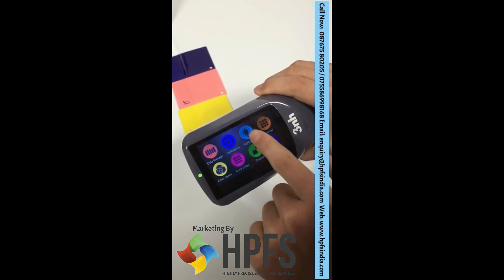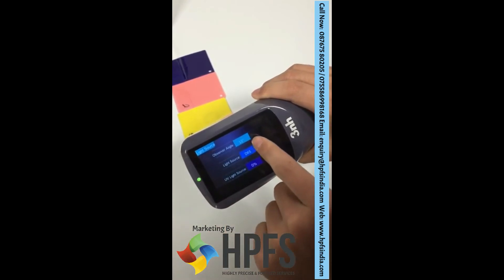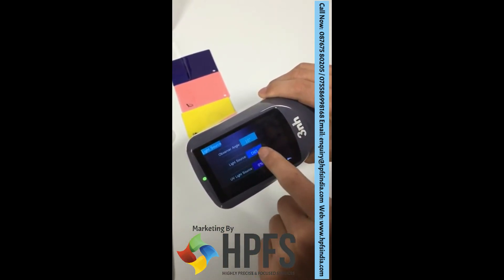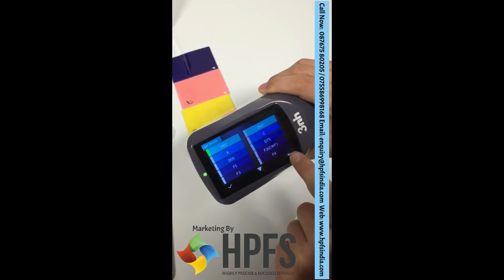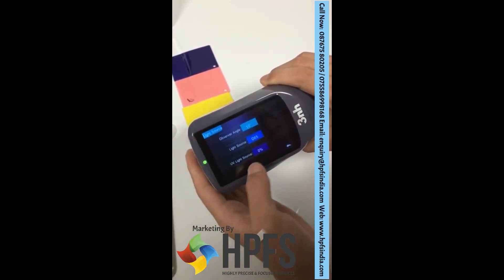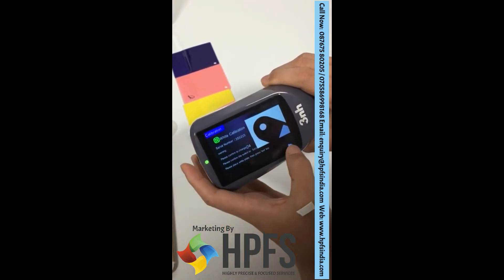Calibration. Light source. Observer angle — you can change the observer angle between 10 degree and 2 degree. Different light sources are available here. UV light source: calibration is needed every time you turn the UV light source on or off.